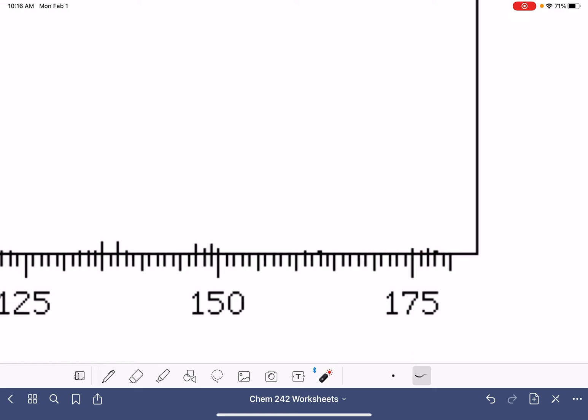So there's our bromine again and there's our bromine again and there it is again and then here we have it right there again. So each one of these tick marks represent one. So this right here is our M plus two peak.